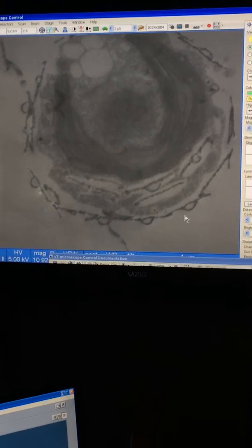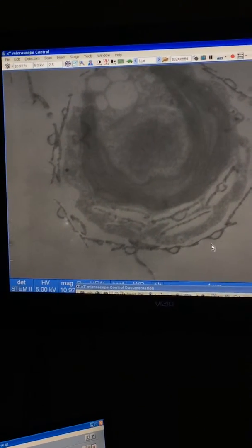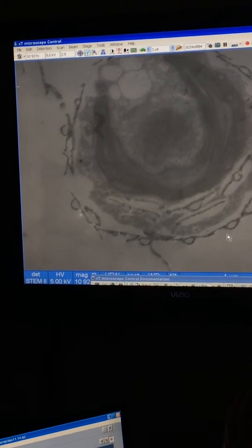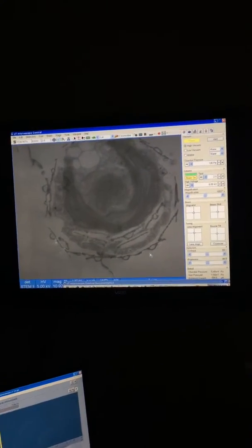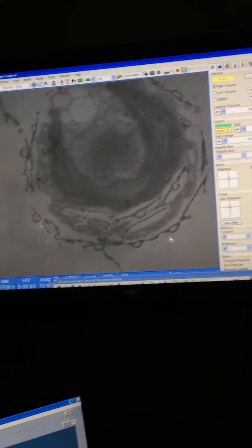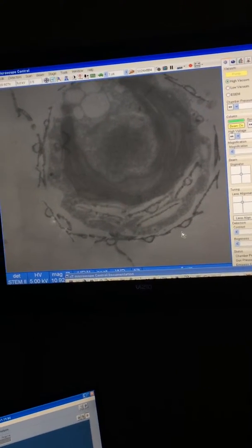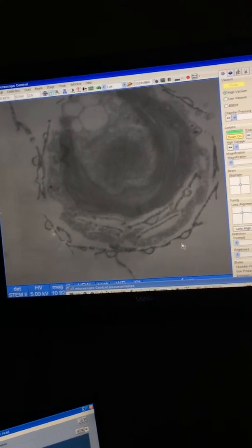And different groups of these single cell plants have different compositions in their scales. So these scales are silica. In another group called coccolithophorids, those scale-like things are called coccoliths, and some of them make up a large component of things like the White Cliffs of Dover, which are the residuals of plant cells.